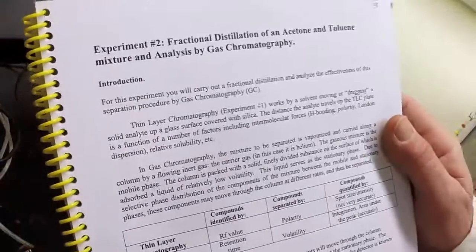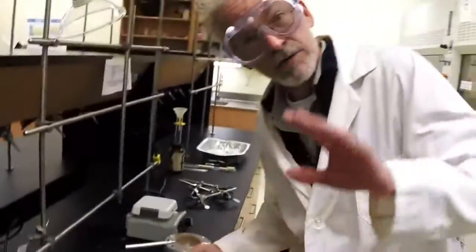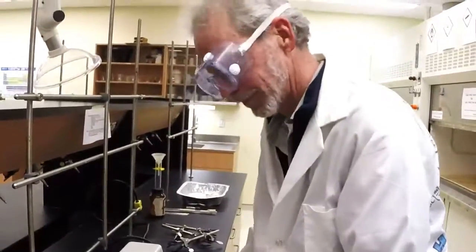Here we go. Experiment number two: fractional distillation of an acetone-toluene mixture. Today we're going to try to learn how to do a fractional distillation properly.